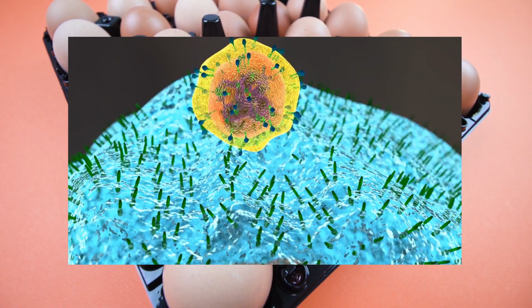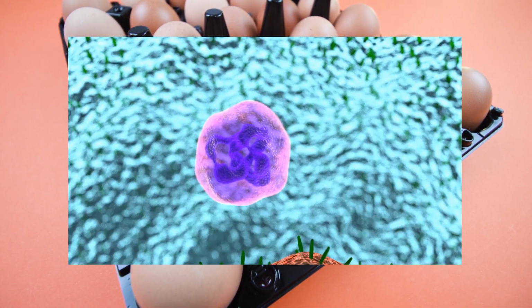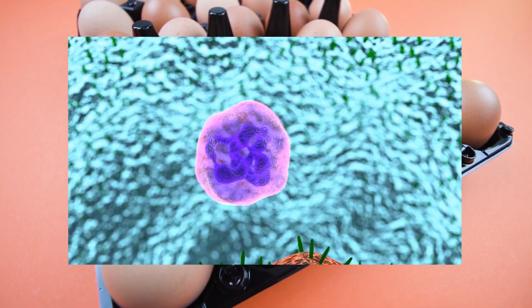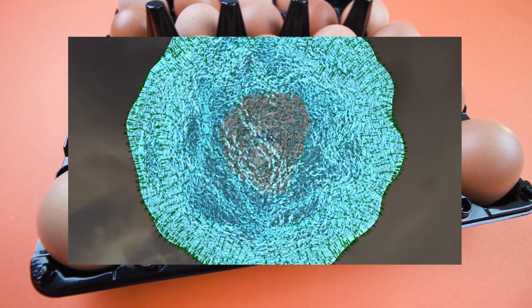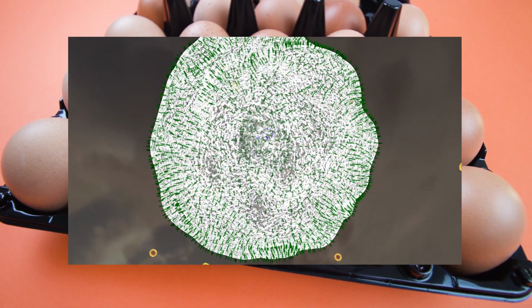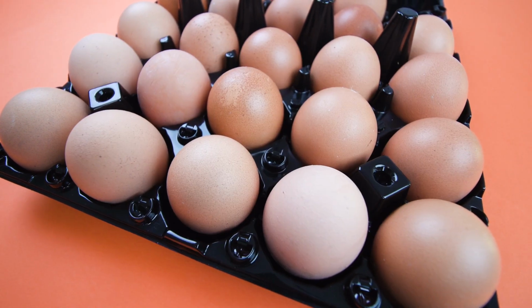This creates a mass of new viral material and live virus. The egg is left to incubate for several days in this state. Often a period of roughly 3 days is used. Eggs are then chilled to somewhere between 2 and 8 degrees Celsius. This is useful as it constricts vessels within the egg and it makes the next steps that much easier.